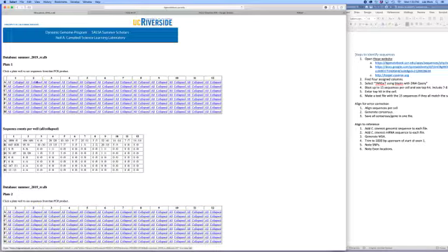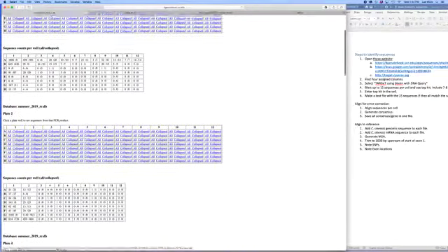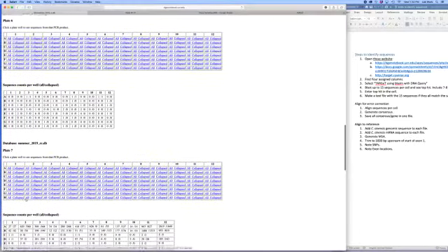Okay, and then this was one primer set that is supposed to be Lux, and this is a second primer set which is supposed to be CHE, on this side. And we can look down here and see the success of the sequencing, and it's not that great, but we got a lot of sequence, at least for these, and sequences for the first few varieties. And each of these represents citrus varieties found at UCR. And then the same is true for plates 2, 4, 5, 6, and 7.